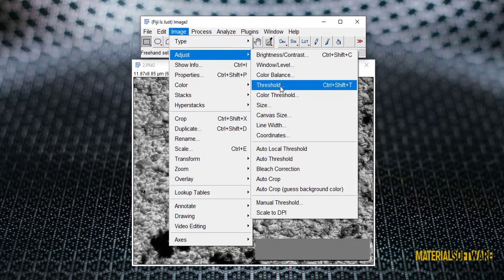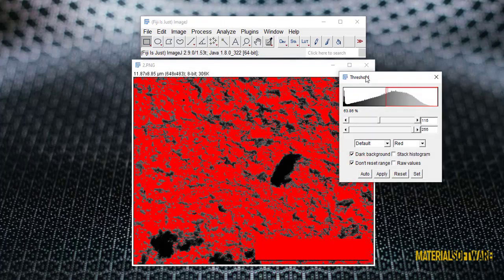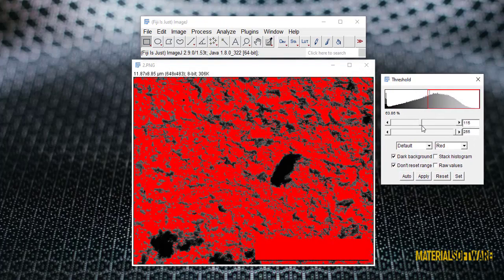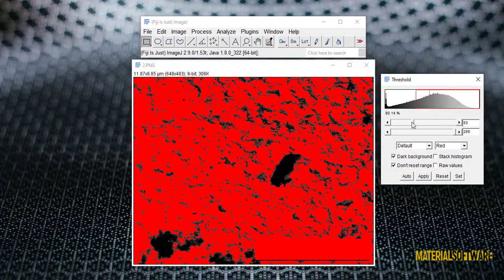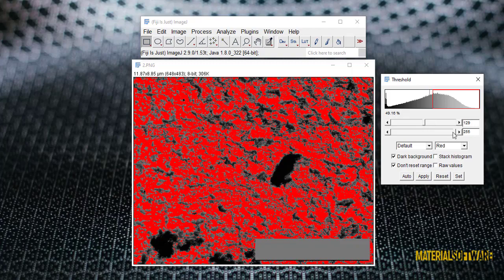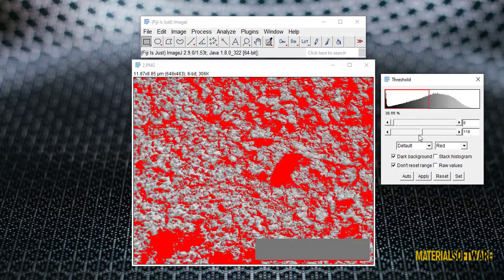Thresholding operation must be done in such a way that only the pores in the image turn red, so with the two levers we have, we decrease and increase until the pores turn red.